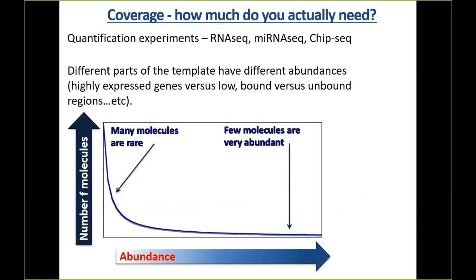It turns out nobody's interested in finding out that 70% of your mammalian cell's RNA is ribosomal RNA because everybody already knew that. Here's the problem, though: if I just do a bulk RNA sequence from a cell, what are 70% of my reads going to go to? If I just bulk pull RNA from the cell, what's going to eat up 70% of my reads? Ribosomal RNA, which we've kind of established nobody cares about. So I have a couple options at this point. I can deal with the fact that I'm going to lose 70% of my reads to ribosomal RNA.